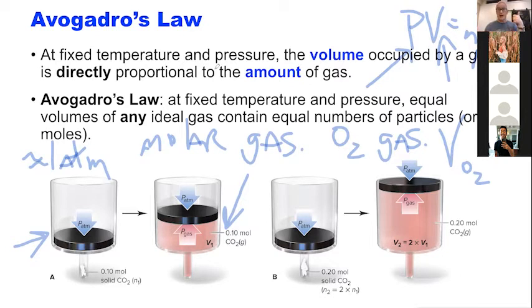If you really want to get accurate, you can look up, like we did last week, and see what the pressure is wherever you are. But it's going to be pretty close to 1 atmosphere. So it'll be like 0.995 to like 1.005. It'll be really, really close. So since we're not squeezing the cylinder and we're not expanding the cylinder, the pressure inside the cylinder will be exactly the same as the pressure outside of it. So we can just assume that it's going to be around 1 atmosphere.